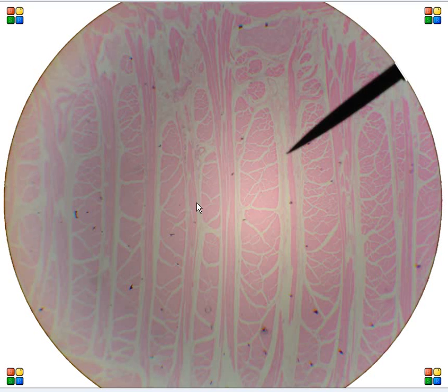This is skeletal muscle from the tongue. So this is a cross section of someone's tongue. What's really cool about this is you've got longitudinal sections of muscle fibers because the fibers go in this direction. But then the fibers also, in this case, are kind of coming out at you in these areas. So you can see the muscle cut in longitudinal section and in transverse section.